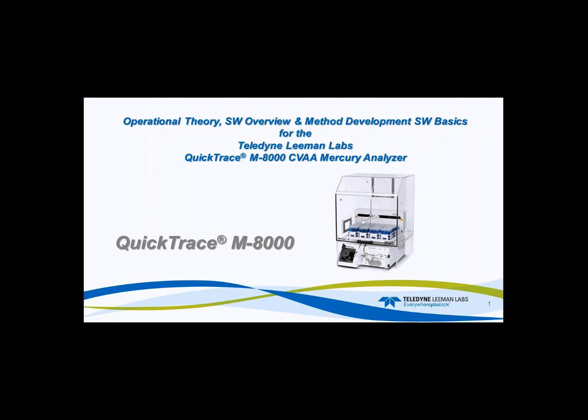Today's webinar is on operational theory, software overview, and method development software basics for the QuickTrace M8000. We will be taking questions at the end of the webinar, so feel free to submit those throughout the presentation.